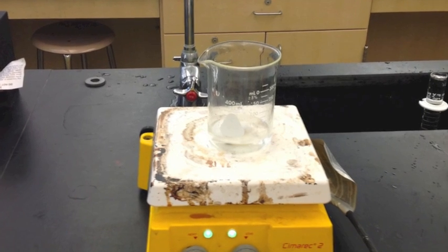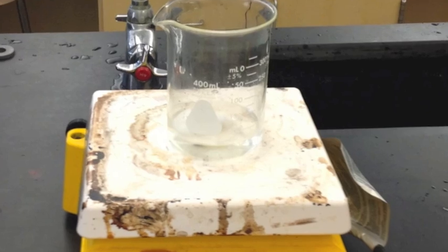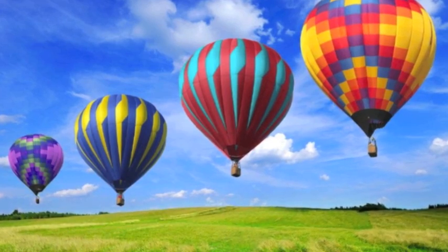Make sure both are on the scale. There's a stir rod in there that you can use to mix it up so you can get the magnesium sulfate solution ready to go.